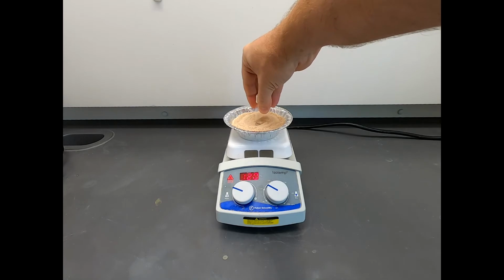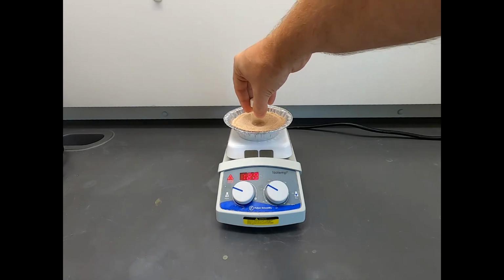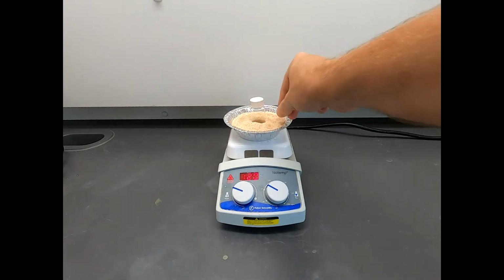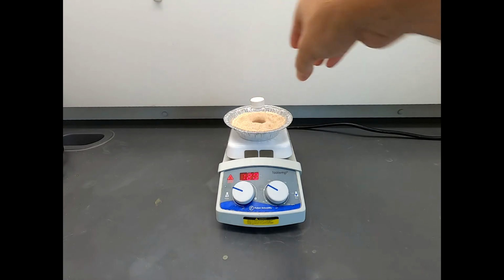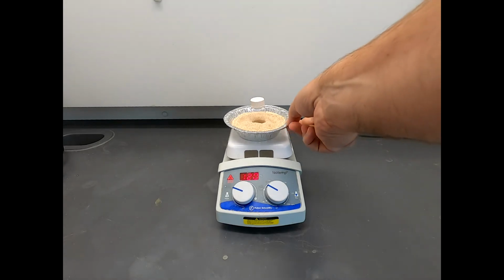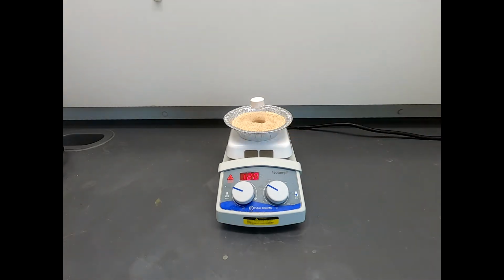And now let's burrow this down into the sand. This ought to be about the temperature of boiling ethanol, which is around 80 or so degrees Celsius. The sand bath is at 120, so the sand bath is a little bit warmer than our desired boiling point. But this is now going to stir at higher temperature, and we'll come back. It's supposed to go 4 hours. We'll come back in a bit and see how it's doing.